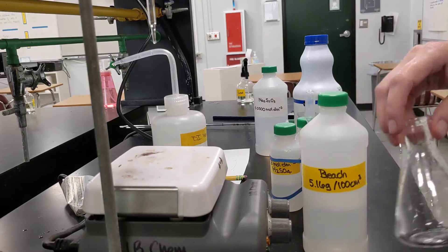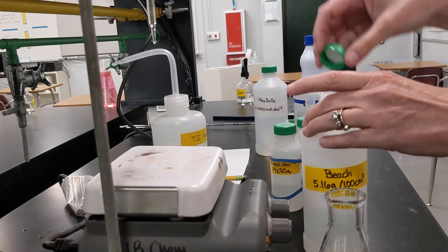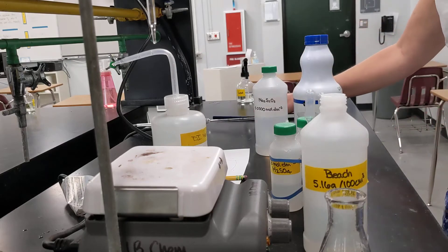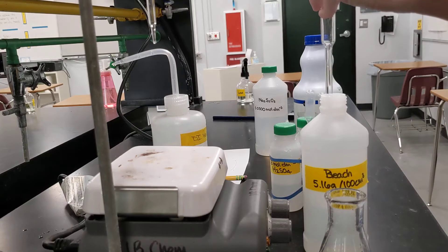So I am going to, into my conical flask, pipette 10 cubic centimeters of this bleach solution with a volumetric pipette.